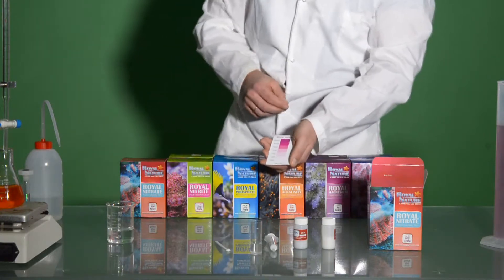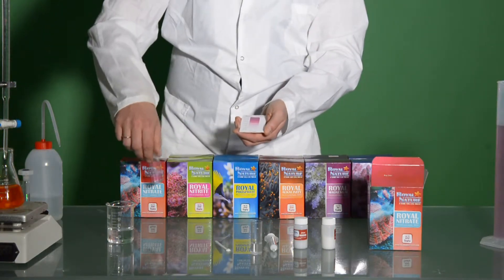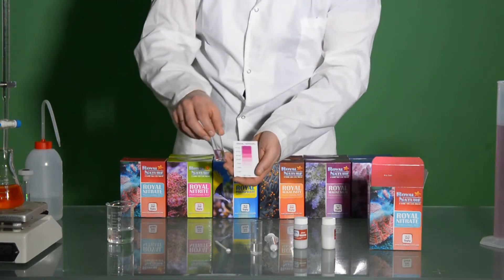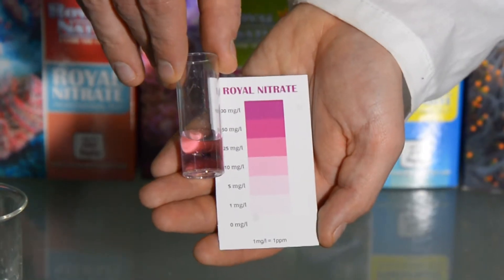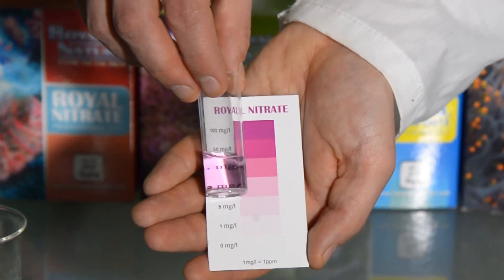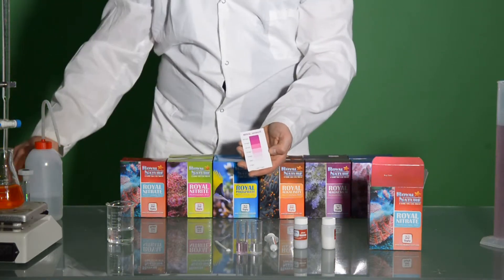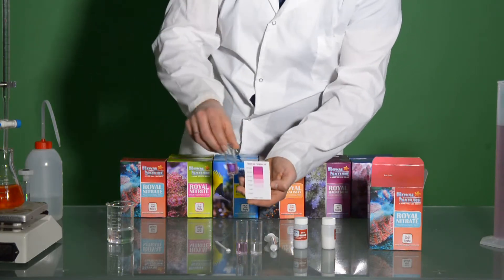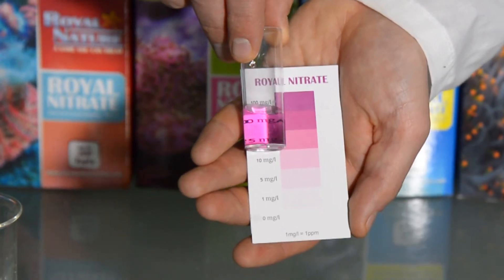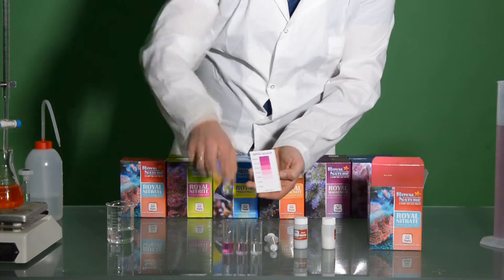Now, like with the nitrate test, we prepared in our lab two more solutions just to see the different colors. The first one is a solution with 10 ppm of nitrate — holding the test vial next to the chart, we can see the corresponding color next to 10 ppm. The second solution is 25 ppm of nitrate, and holding the test vial from the side, we can clearly see how the color changes to correspond to 25 ppm.